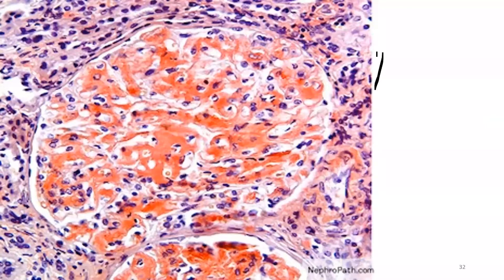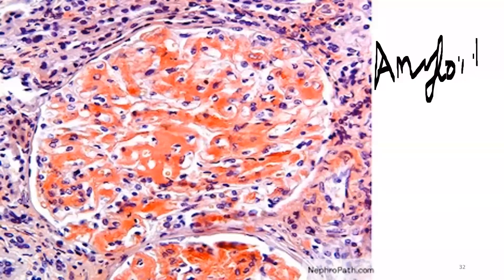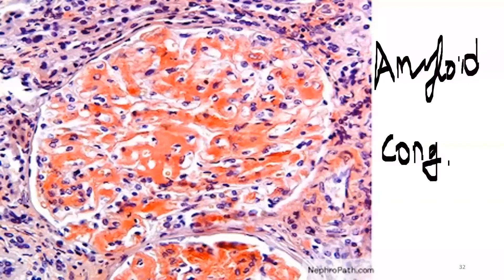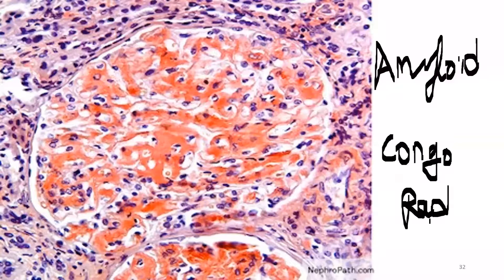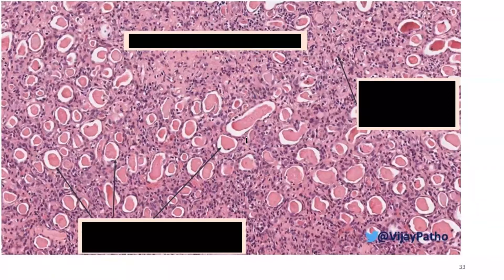This slide shows amyloidosis with amyloid deposition in the kidney. The stain used is Congo red, showing a reddish color appearance. Remember that apple green birefringence is seen under polarized microscopy — apple green is the birefringence color, not the staining color.